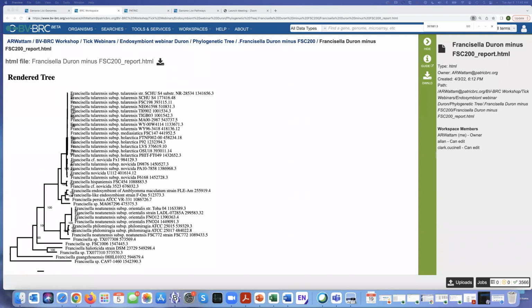What is the method being used to assign genes to synteny/orthology groups? It's the global protein families that are assigned with any annotation. What the algorithm does for the tree building is it gets the group of genomes, and it looks for those global protein families, which we call PGFams, that have only one gene in that protein family.